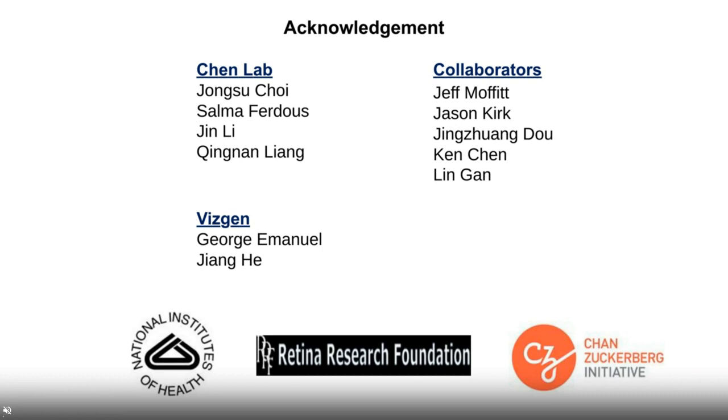Therefore, if you're looking at a discovery experiment where you want to do unbiased discovery, then this will be a limitation. It is possible, as already published, to look at 10,000 transcripts, for example. But I think those are relatively challenging right now, based on my experience. So if it's truly discovery, this will be a little bit harder. But with that said, by combining single-cell RNA-seq with MERFISH, and with some computational analysis, you still can answer that question, even for discovery.